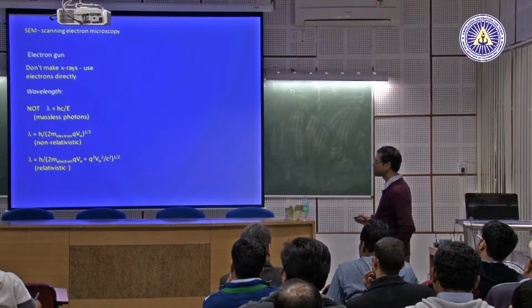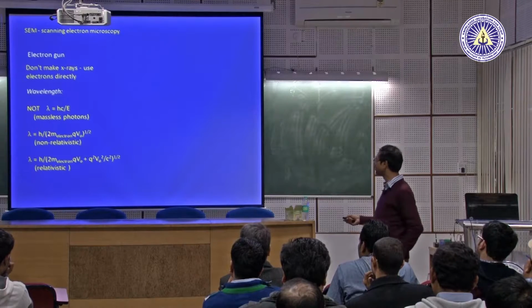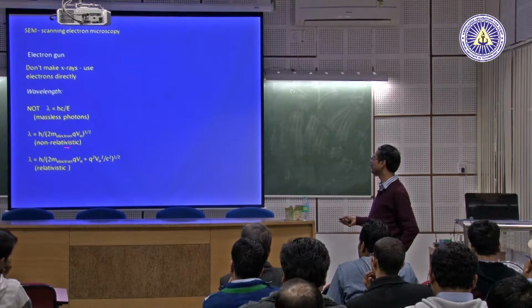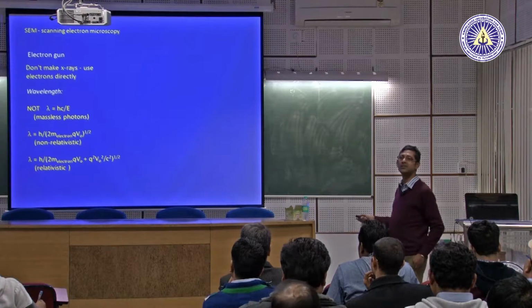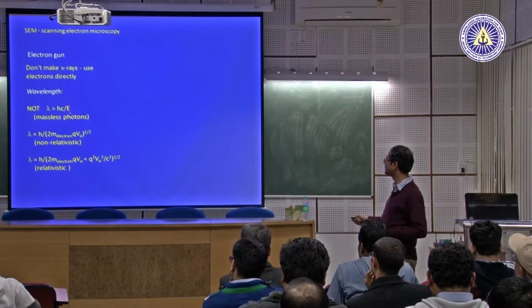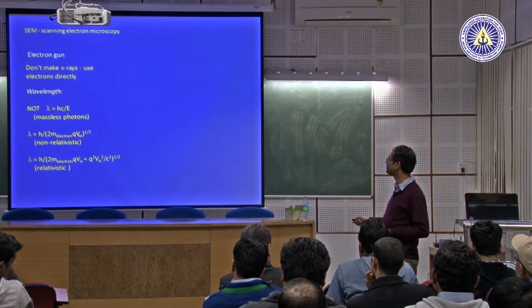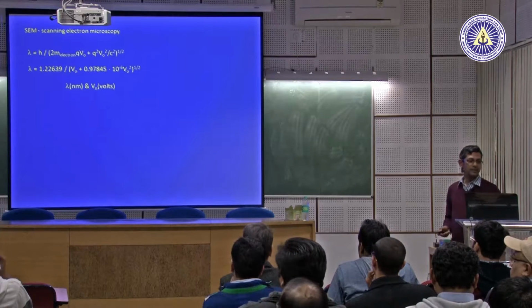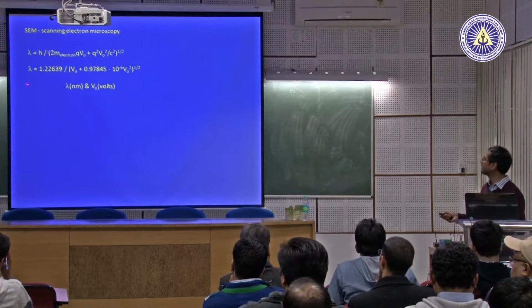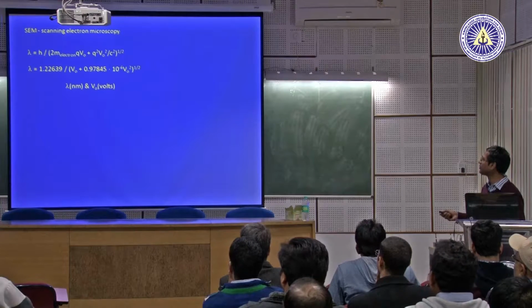But in a scanning electron microscope, because the accelerating voltage is very low, you can use h by m0 qv actually. This formula can be easily used, because this is the p actually. P is the momentum. This is not E, this is P, momentum. So momentum comes from mass into velocity and q. Anyway, I think here you can see clearly. You can convert in terms of volts and other things.